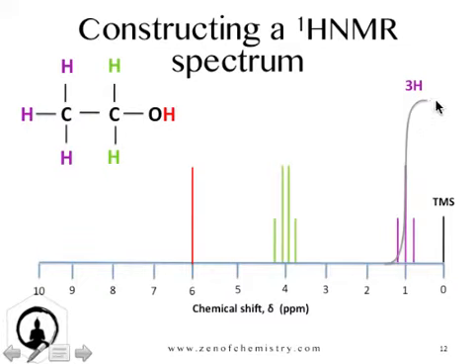We've got 3H, so we can say this group of peaks is due to 3 hydrogens, 1, 2, 3. This one here, you'll see it's about 2/3 the height of this one. So that's about 2H, due to 2 hydrogens. And then our last one, compared to the first one, its height is about 1/3 of the height. So we give that a 1H. It's due to our only 1 hydrogen here.